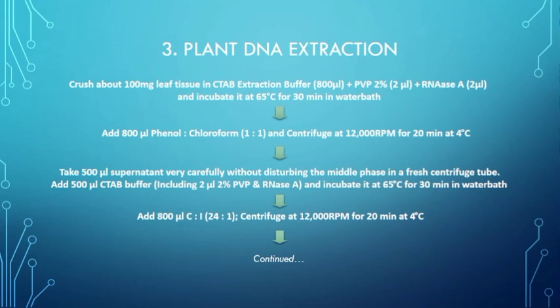You will mix this into the DNA extraction buffer during your DNA extraction. And side by side you need RNase A. This you will also use at 2 microliter, and we need it when your OD value is larger than 1.8, because that means you have RNA contamination in your DNA sample.